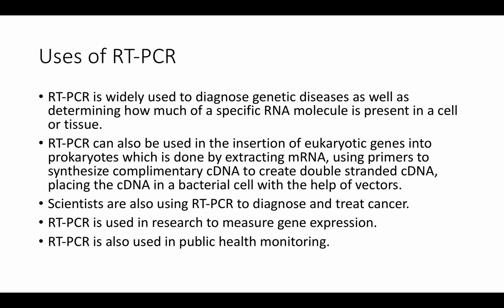So what are the uses of RT-PCR? RT-PCR is widely used to diagnose genetic diseases, as well as determining how much of a specific RNA molecule is present in a cell or tissue. RT-PCR can also be used in the insertion of eukaryotic genes into prokaryotes.